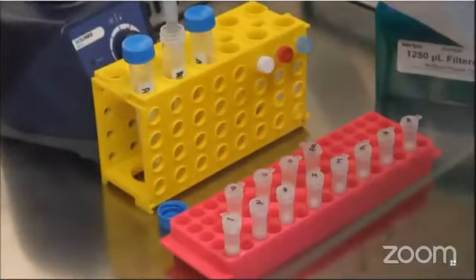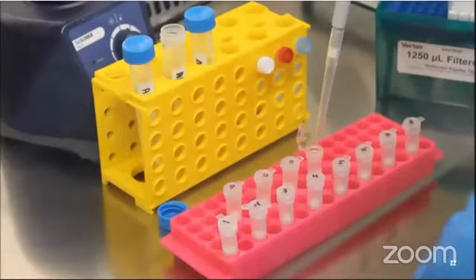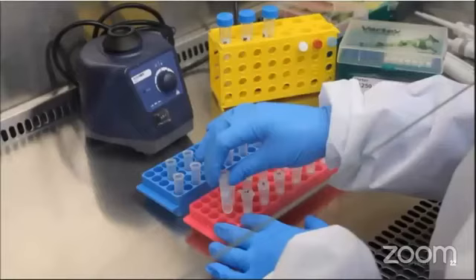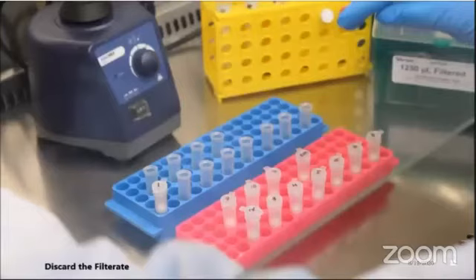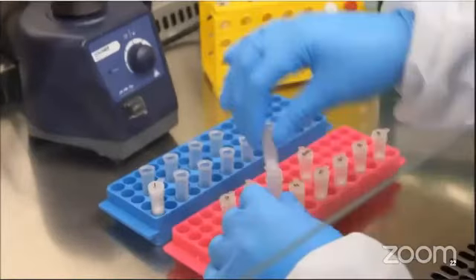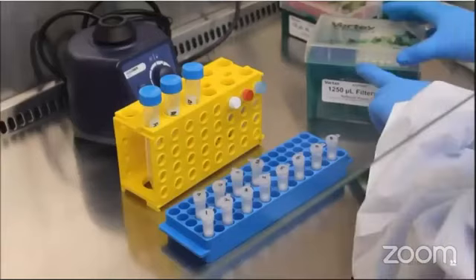These buffers contain chaotropic salts that increase the solubility of non-polar substances in water. They denature the protein because they have the ability to disrupt the hydrophobic interactions, but they do not denature the DNA or RNA. Now discard the filtrate and place the column into a fresh collection tube. This is the ENC, the last one, the extraction negative control.